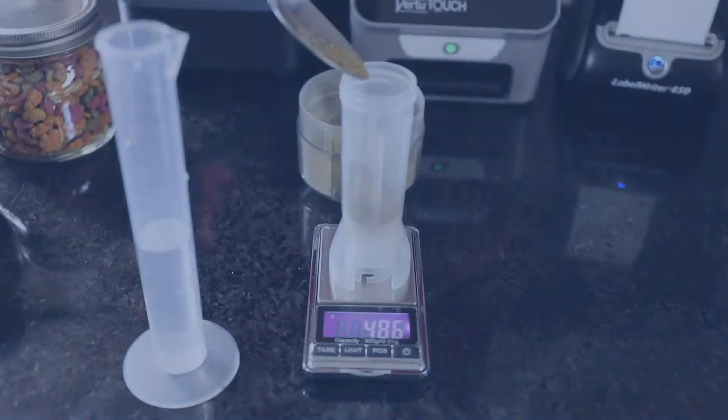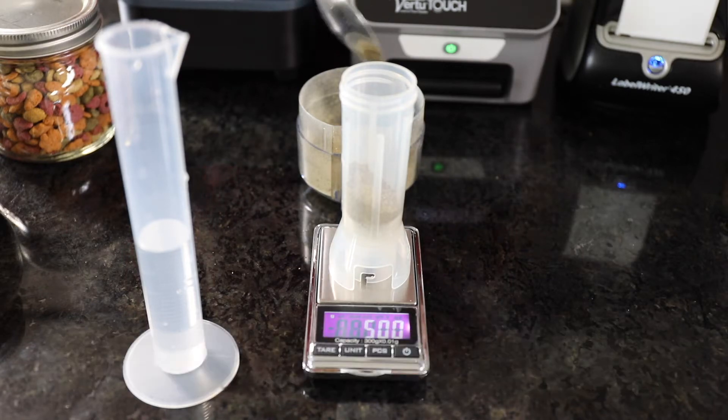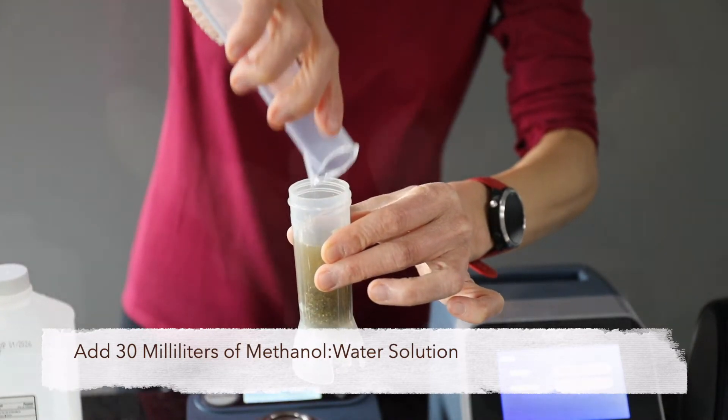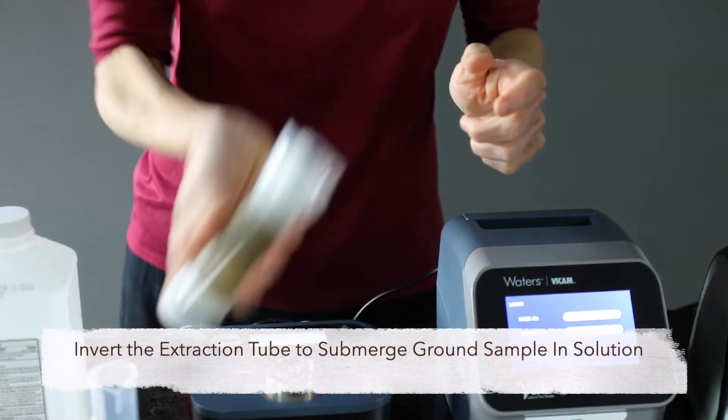To extract the aflatoxins from a finished feed sample, measure 5 grams of ground sample into the Virtu Prep extraction tube. Add 30 milliliters of 80/20 methanol water and replace the tube cap. Invert the tube or shake briefly to wet the sample.